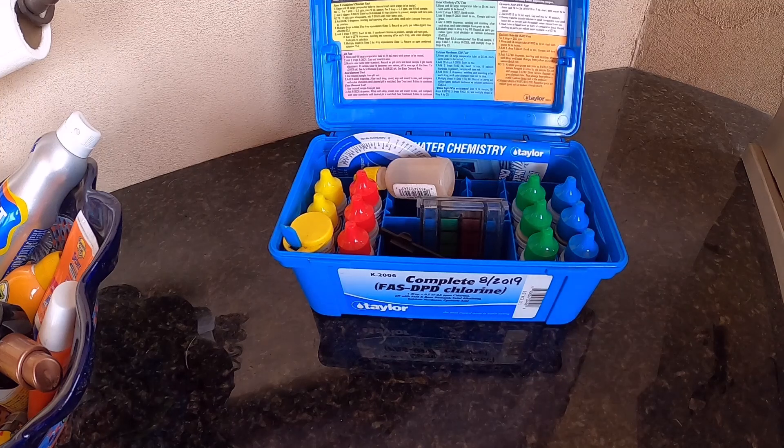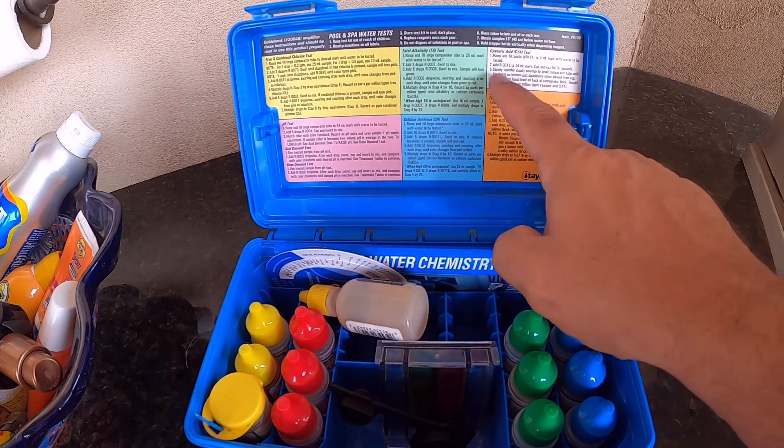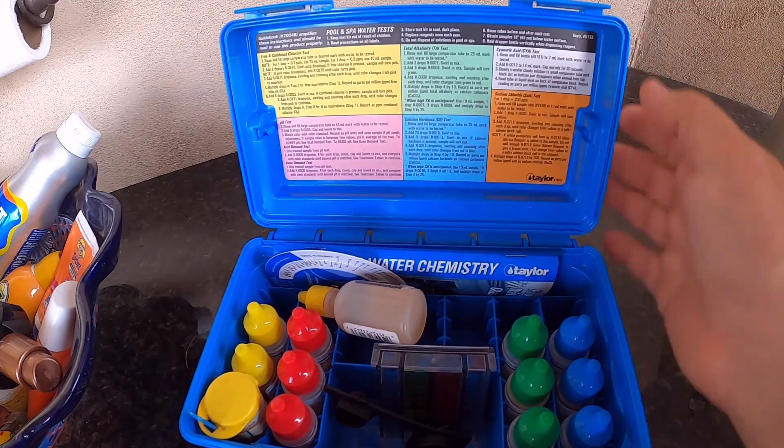I'm going to show you how to do a cyanuric acid test with a Taylor K-2006 test kit. With this test kit, you're going to be following the instructions in the white section in the back of the cover.